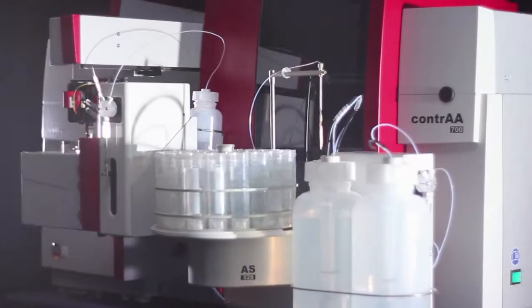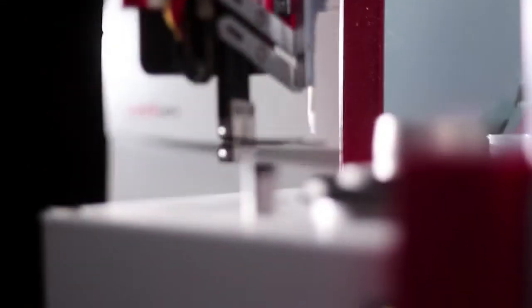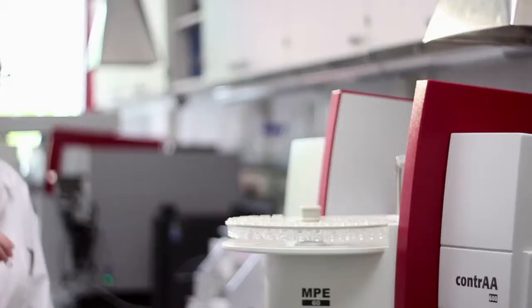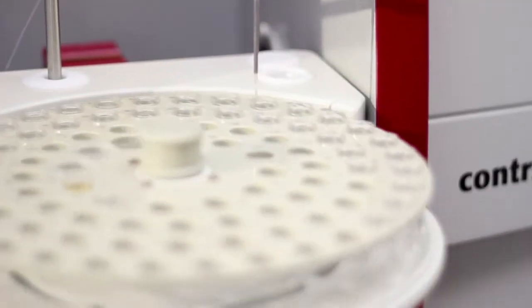The ContrAA is the AAS of the 21st century. With its unique single light source and high-resolution spectrometer design, the ContrAA provides true multi-element analysis and a yet unknown degree of flexibility. The display of sample spectra and simultaneous spectral background correction are the key to the superior performance in all parameters. ContrAA sets new standards in spectroscopy.